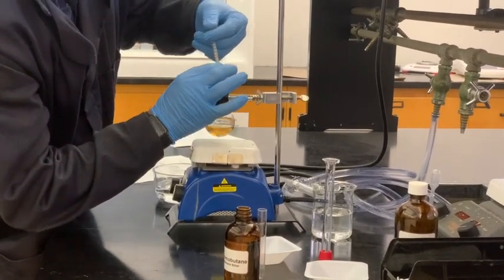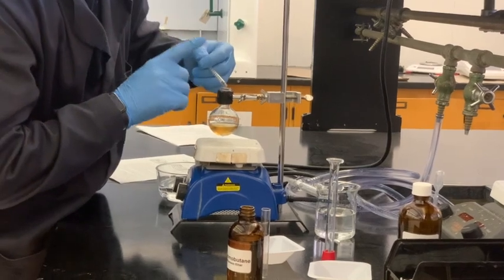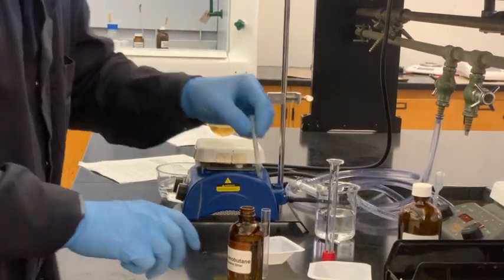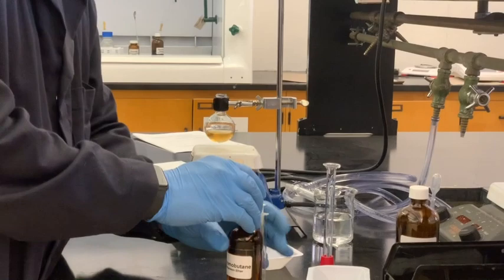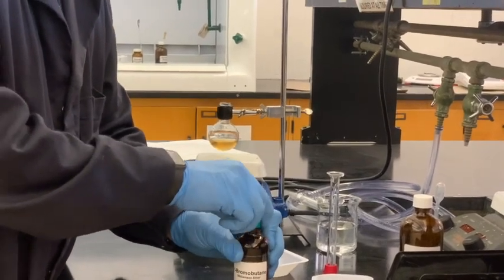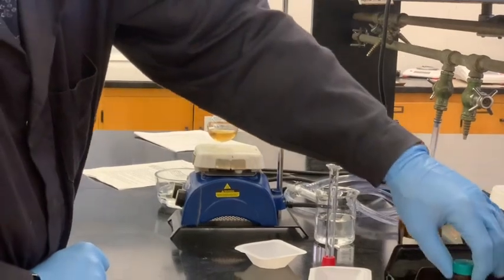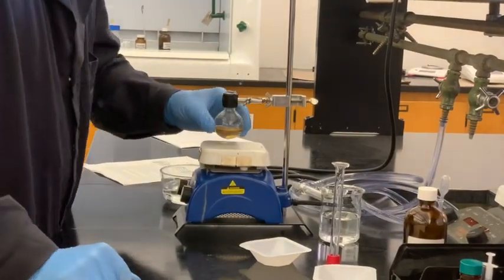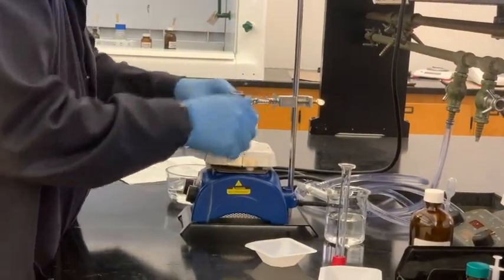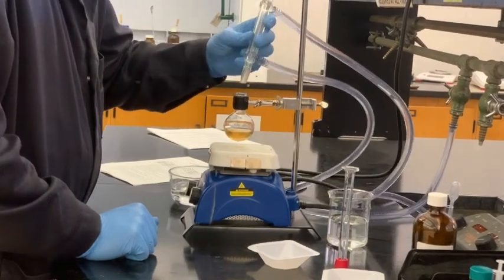That was almost exactly 0.6 milliliters. So you want to make sure you look up the density of the bromobutane to figure out exactly how many grams and thus how many moles you were working with. But once we get that in there, we just replace the reflux condenser.